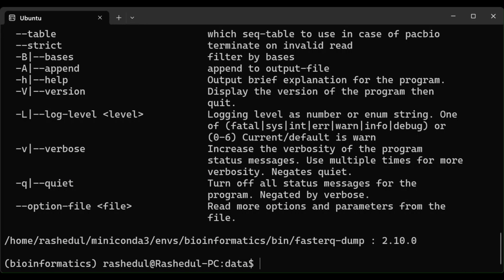Also, I want to note that it is important to learn basic bash commands, for example, while loop, for loop, and how to access directories. I have made a separate course on basic bash commands. Please take a look at those videos.